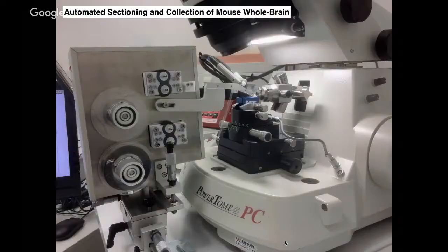Now, when I first attempted this, I explained to the people selling me these machines and other ultramicrotomists what I was intending to use their machines for. And the old school ultramicrotomists were just giving me warnings that something terrible would happen if I tried to actually cut through a centimeter size sample with these ultramicrotomes. And so this didn't discourage me at all, but actually got me quite curious to find out what would happen if I seriously attempted this. So, of course, I went ahead and did this.